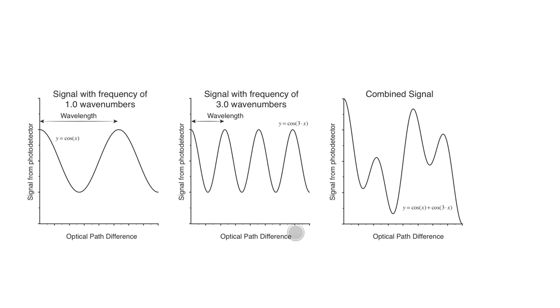Now, frequencies in IR are generally discussed as being between 500 wave numbers and 4,000 wave numbers. So basically, the wave oscillates 500 times in a centimeter or up to 4,000 times in a centimeter in the range that we look at with most of our mid-IR spectrophotometers like the one on your bench. Why that range? Why not more? Why not less?